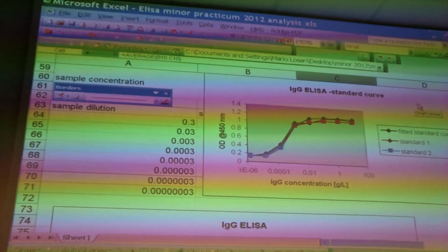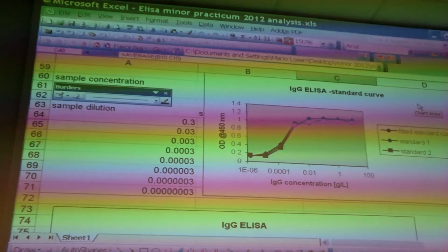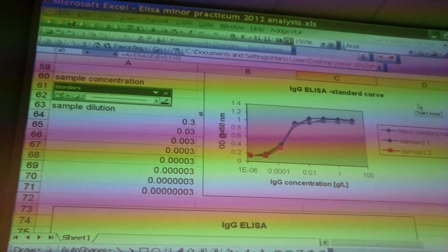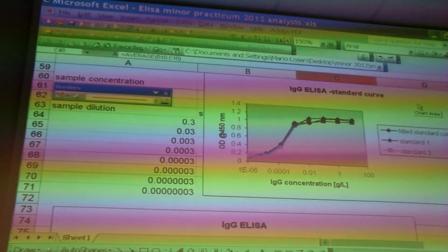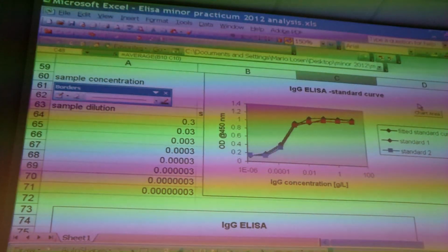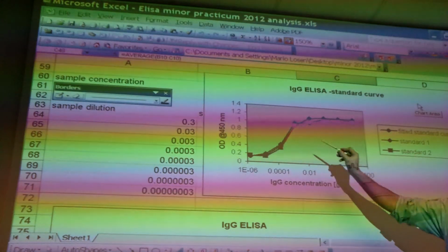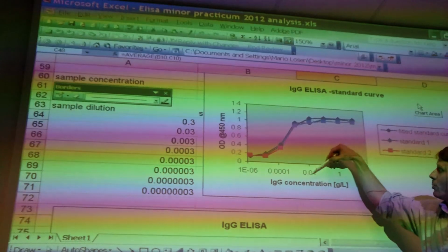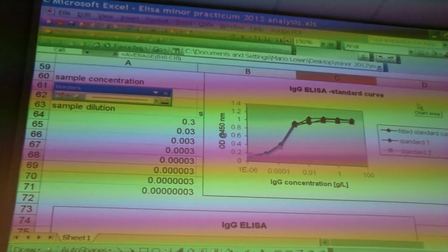So, let's say we have our sample at 1 gram per liter. Can we use that directly for calculating the concentration? We add one well of sample and then we want to measure the concentration. It would not be that good because your calibration curve is very flat, so you don't see a lot of difference. 1 is not even different from 0.01, right? It's too shallow here. So we can't.